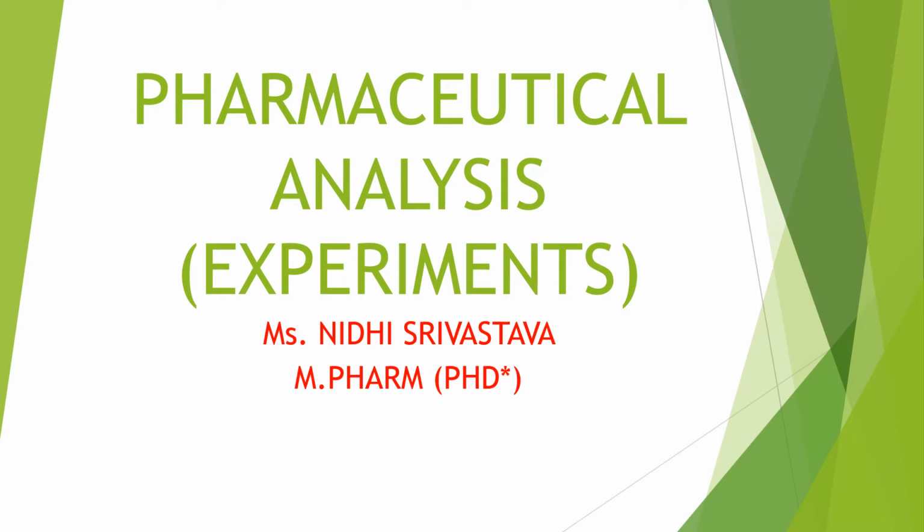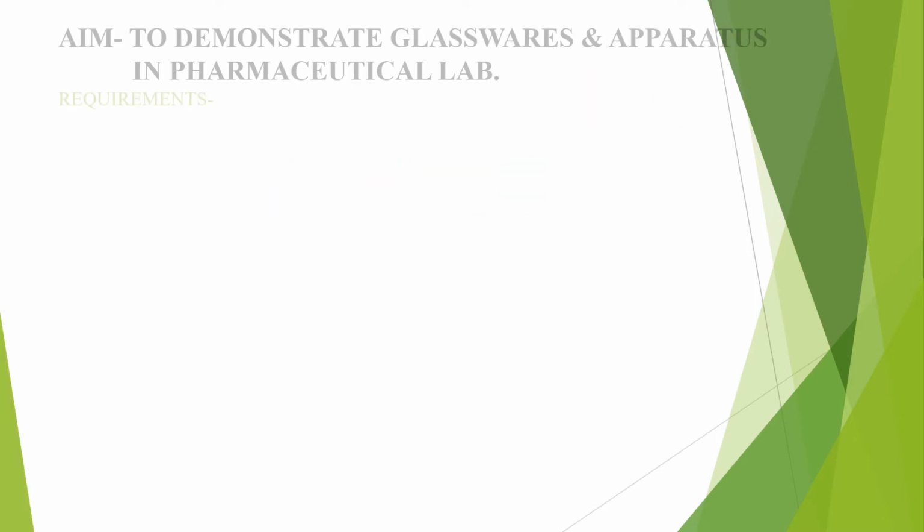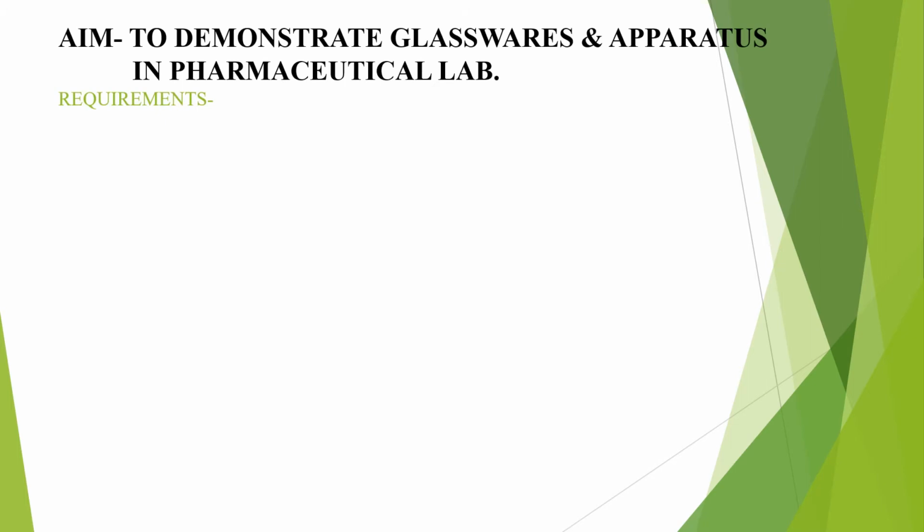Today I will discuss pharmaceutical analysis experiments. The aim is to demonstrate glasswares and apparatus in pharmaceutical lab.